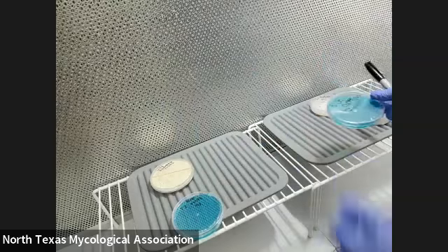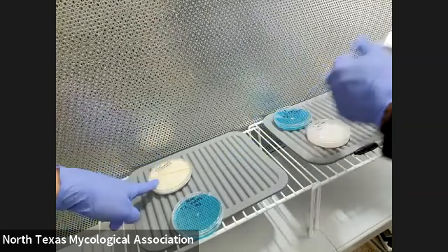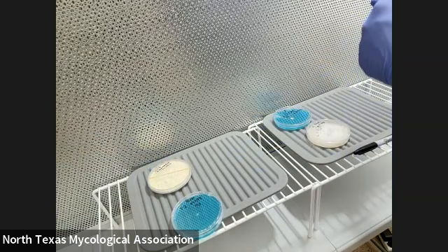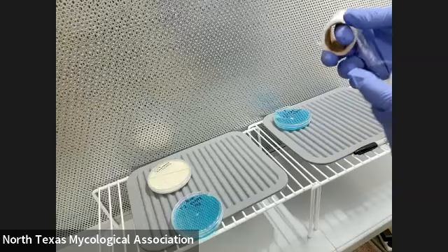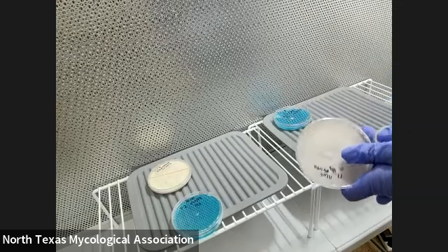Blue oyster. You can wrap it too. This one I'm going to use to show you how to do agar-to-grain. That one already has mycelium growing in it — it's pretty much fully colonized. I keep it so they last a few months, like six months, in a cool dark spot.